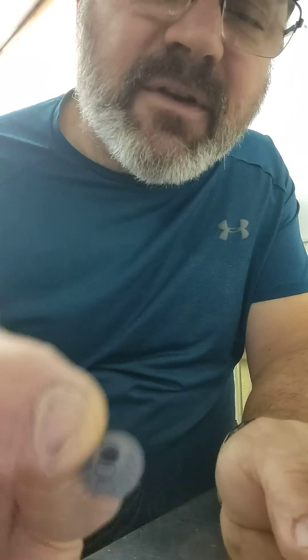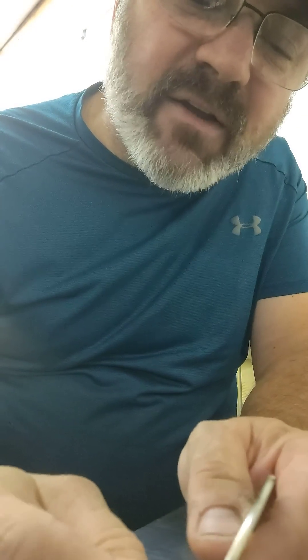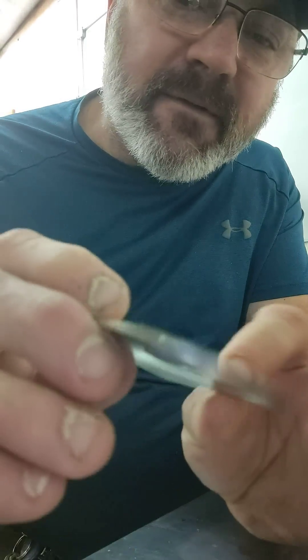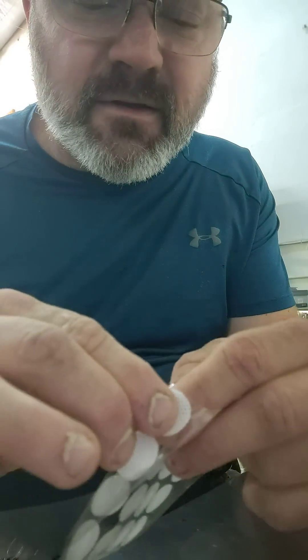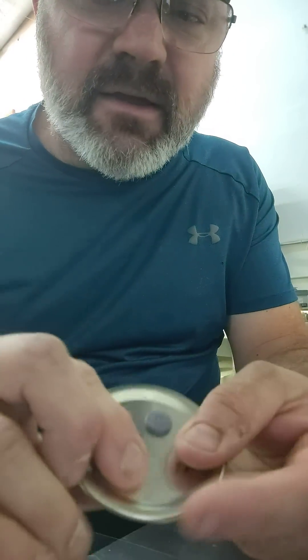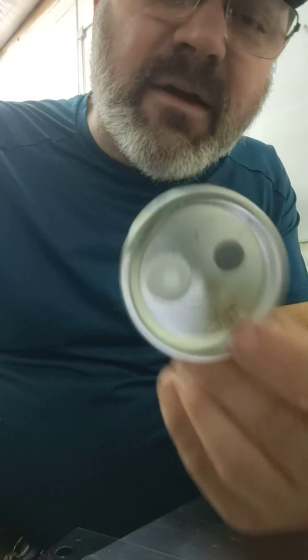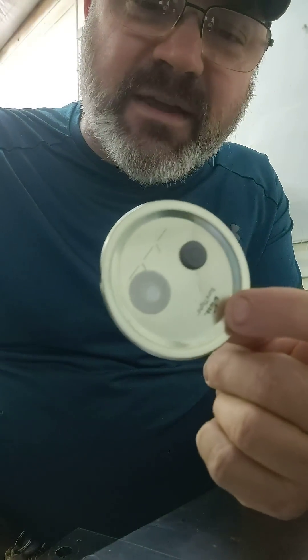You can use this quarter inch injection port or the stick-on kind — they just go right through just like that. And we've got these stick-on micro pour vents. Right there, I've made a jar culture lid pretty easy.